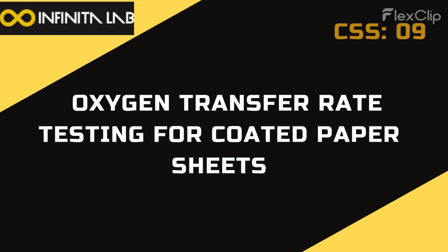And today, we're going to be looking at something you probably touch every day, but never really think about. That's right. It's oxygen transfer rates. It sounds a little technical, I know, but stick with us, because this stuff gets really interesting, I promise. We're going to be looking at excerpts from a case study, all about a company that was testing the OTR, that's oxygen transfer rate, of their super special new coated paper sheet.